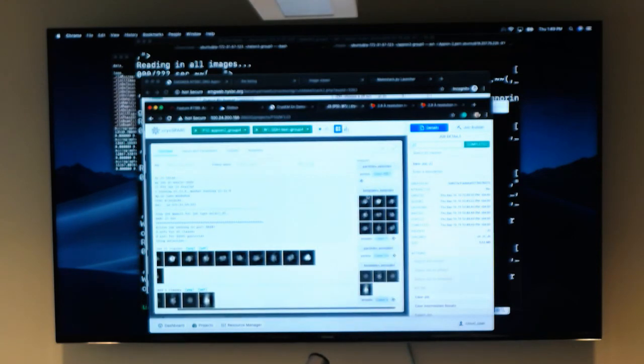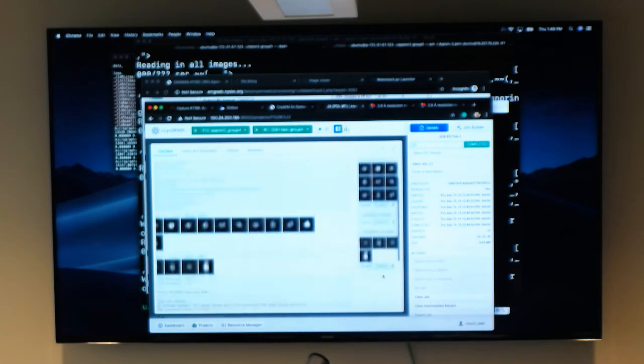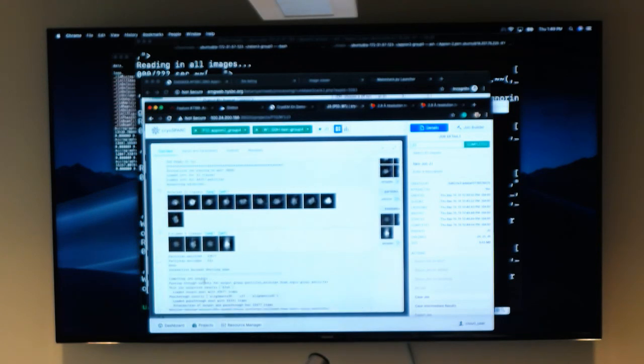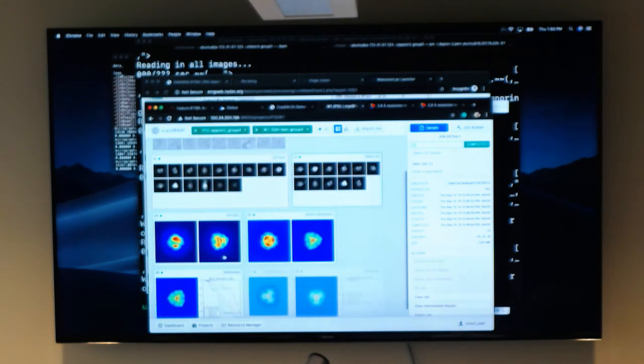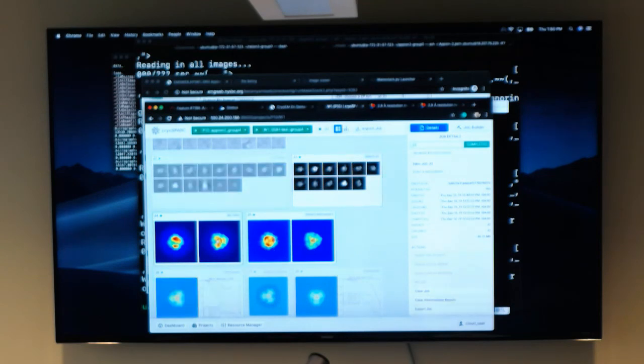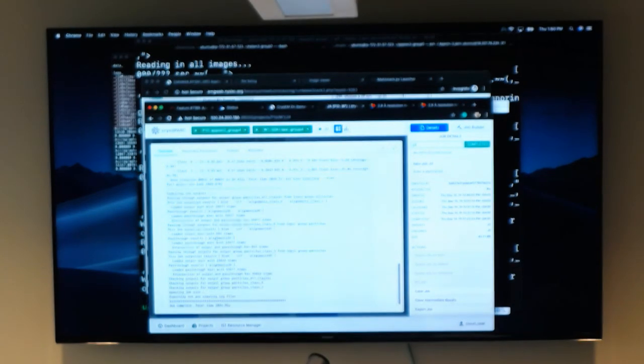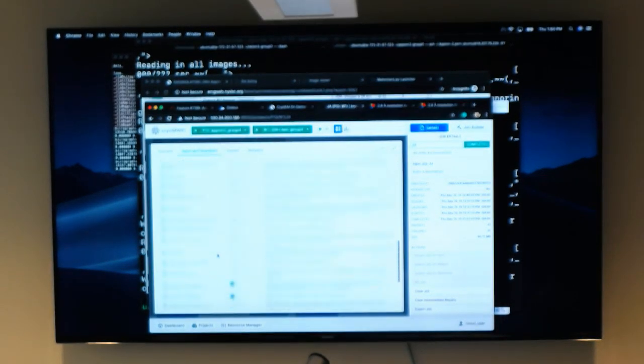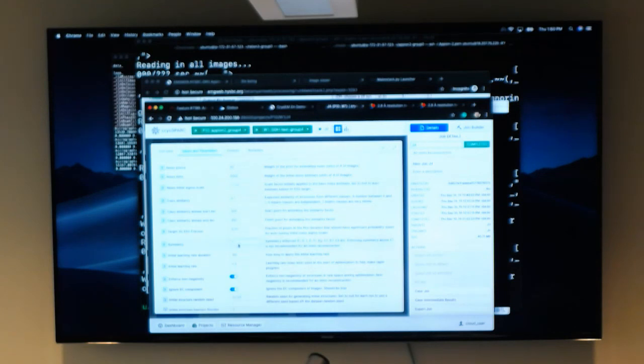For particle selection, this is clear where it says how many particles were selected and excluded. This makes sense because you can see particles with secondary structure features that perhaps didn't align very well. Then ab initio, and they also did heterogeneous refinement. In this case, they chose 2 classes. Some groups found that applying symmetry didn't really work out very well in ab initio, so enforcing symmetry above C1 is not recommended for ab initio reconstruction.